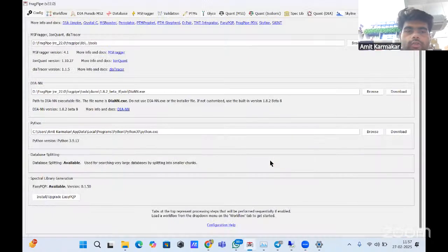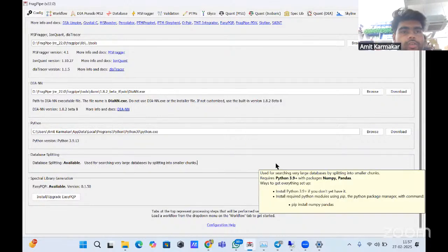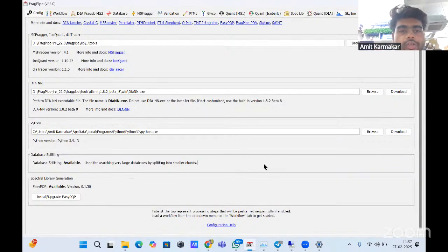So coming to one of the softwares that we use: as in Mascot you have seen, we use Mascot primarily for simple mixtures of protein samples. For complex files generated by the mass spec, we use software like FragPipe. Whatever raw data is generated, we use FragPipe to analyze the data to get which different proteins are identified from the raw files.